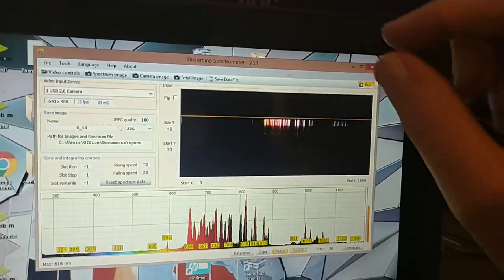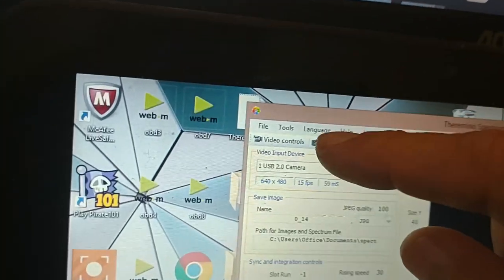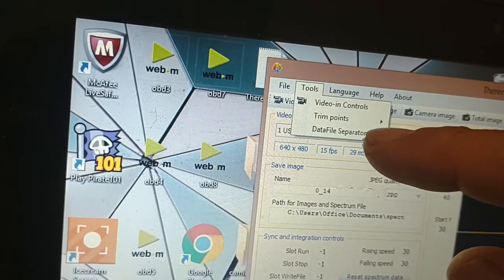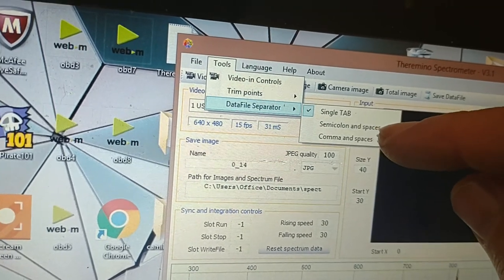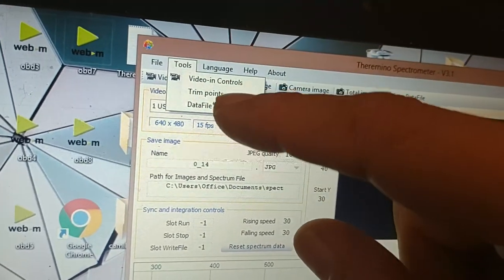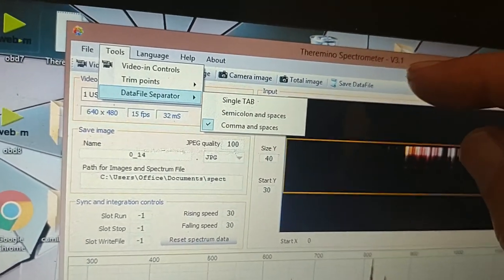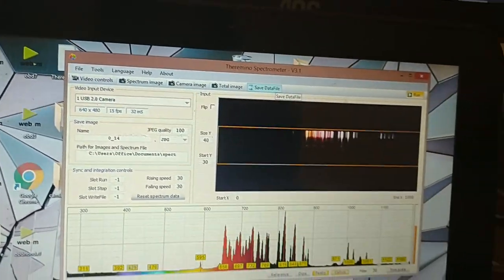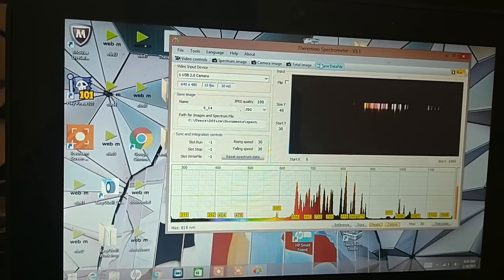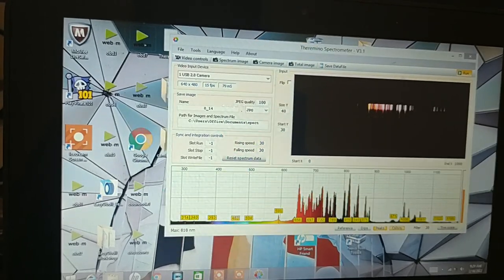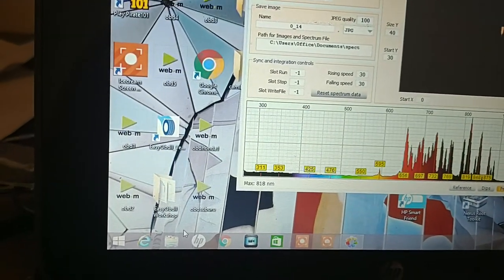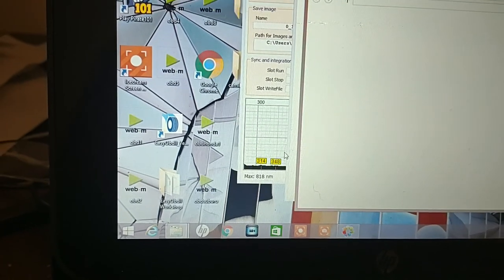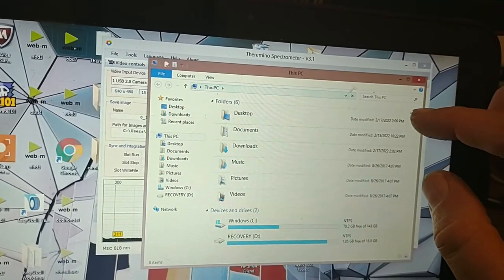Okay, so let's see if we can get the comma separated values working properly. We'll get our neon light on. Let me get it adjusted. Okay, there we go. So now we got a good spectrum there and you can see it in the window up there. You can actually, as you move the spectrometer back and forth, you can see the image move into a more favorable position or less favorable. Okay there, well, that's pretty good right there. So in order to do the comma separated values, let's say they said under tools, you can go to data separator and you can choose whether it's tab, colon space or comma and space. And so I'm going to put it on comma and space. Let's see if it took that. So comma and space. And then I guess you just do save data file. And let me go into our place where we've been saving these. See if I can find the folder again. And let's see if I can see the comma separated values.